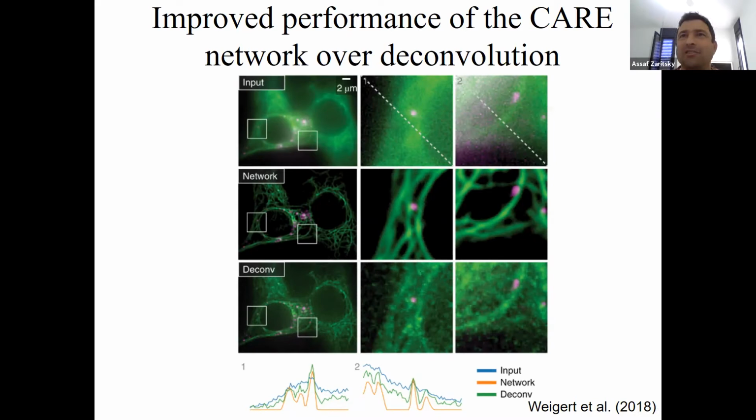And the idea is, what is the advantage of the machine learning model? That it is based on the true data, right? So it's data driven. It's not model driven. The deconvolution says, okay, I know the physical parameters of the system, and I'm going to try to reverse them. I'll do my best, I'll do these transformations and we'll try to improve the image.